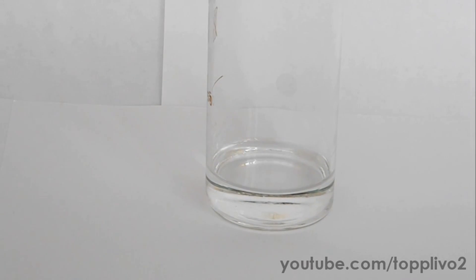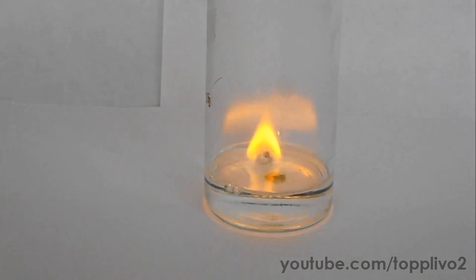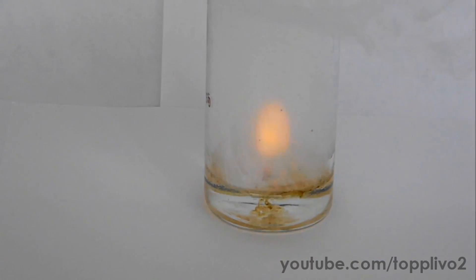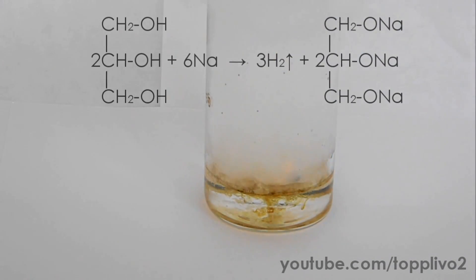Moving to the next reaction — the interaction of sodium with hot glycerol. It is poured into the beaker, and let's add a piece of sodium metal. Sodium immediately melts and lights up in the hot glycerol. This produces hydrogen and sodium glycerate.